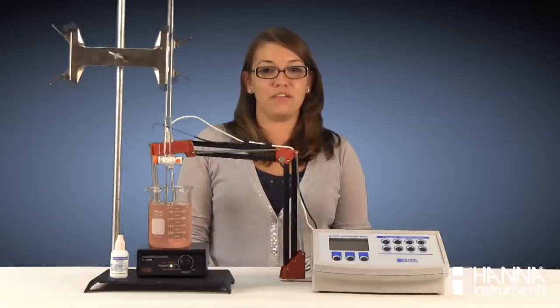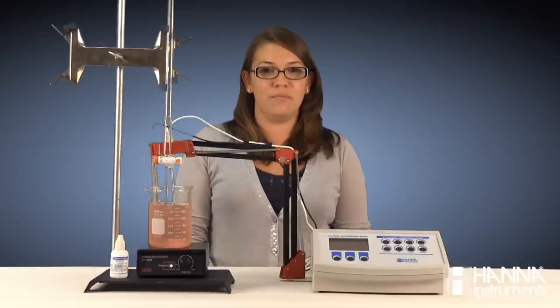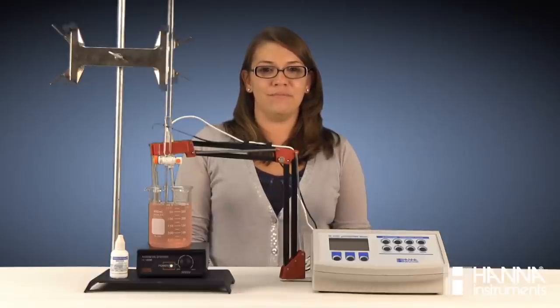A pH meter and an electrode is a little more expensive and requires some knowledge of technology, but there is no subjectivity in the reading. The 8.2 endpoint is easy to detect among many users, so results are highly accurate and highly repeatable. If you have any more questions about titration, please visit www.hannahinst.com.